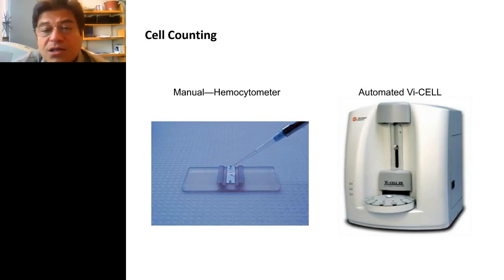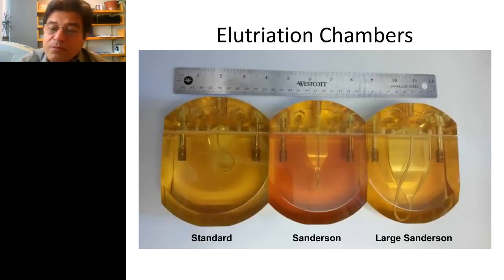Of course, cell counting as well as cell sizing, you can attempt to do on a hemocytometer. It's kind of tough. Having an automated system like a Vi-CELL is really handy for this workflow. You can get your answer with a high degree of accuracy. The other thing that is really difficult to do manually is to get a feeling for the distribution of sizes, if there is a distribution. And that can be handy if there are a lot of cells in cell cycle as well as cells that are not cycling. You can see those two sizes and can work from there.